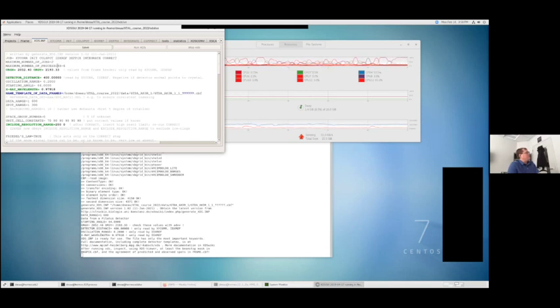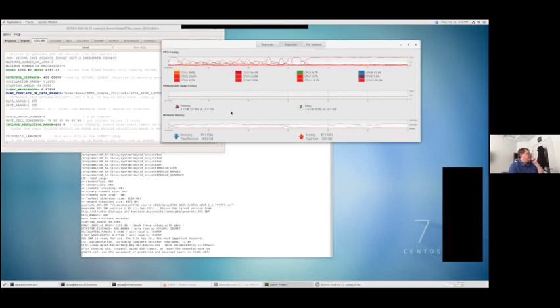The more jobs and processors you use, essentially the more memory that the processes try to access. So you're limited by the number of processors you actually have, right? But you're also limited by how much RAM you have. In my case, I have 12 gigabytes of RAM. So why do you want to increase these?